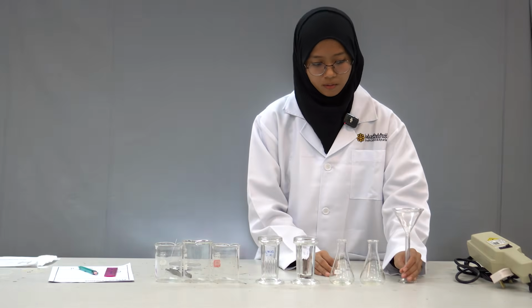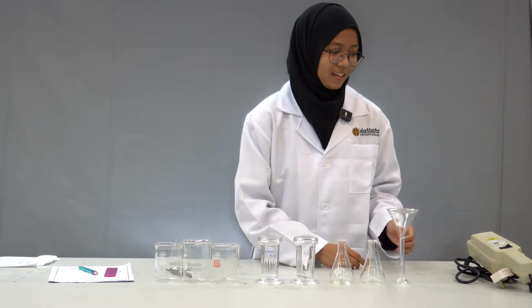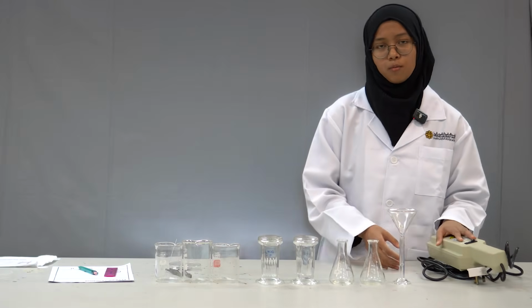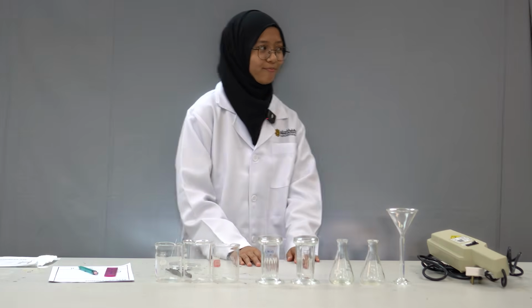Lastly, a measuring cylinder to measure, and a UV lamp to visualize the movement of our components on the TLC plate. So that's it. I will pass to the next person.